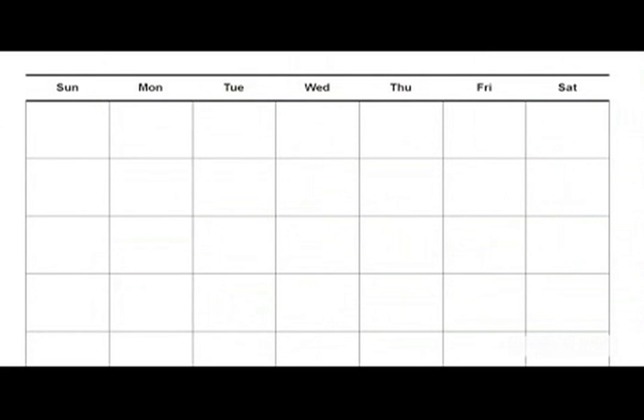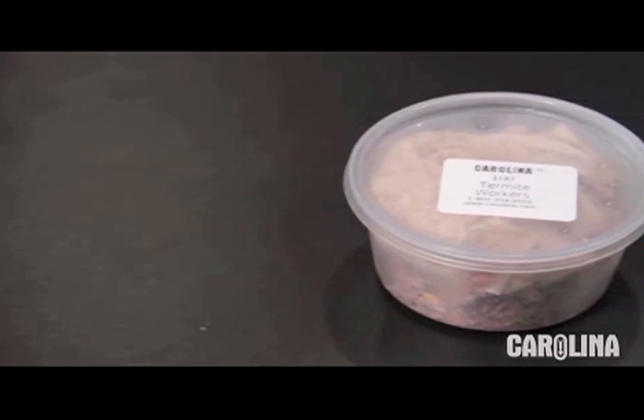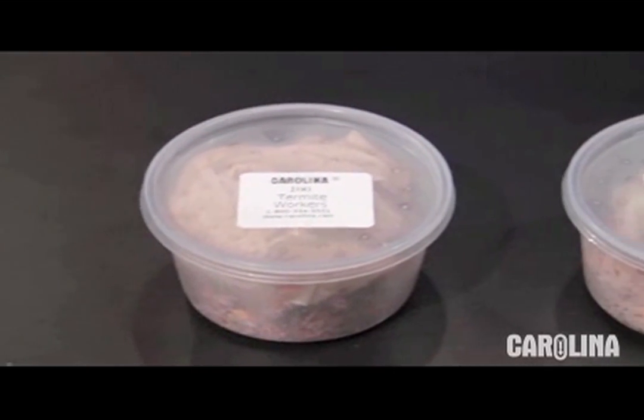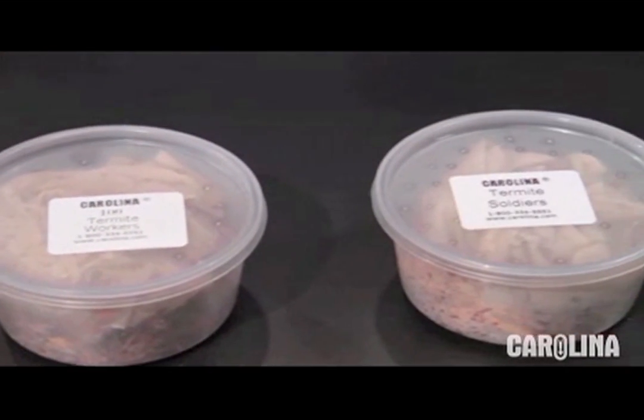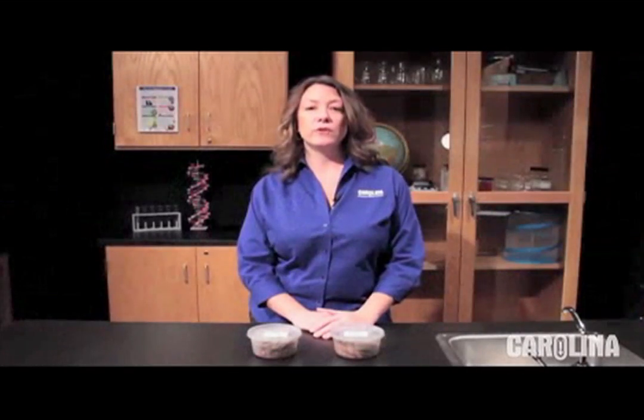A termite culture should be ordered a couple of days before use. We recommend receiving it on a Tuesday, Wednesday, or Thursday and using it the same week if at all possible. Try to arrange delivery at a time when you can personally receive the package and examine its contents. Please inform your institution's shipping department or front office personnel about your living material package and when it should be arriving. Make sure that they place your package in a dark climate-controlled area, but not the refrigerator, until you can attend to it later that day.